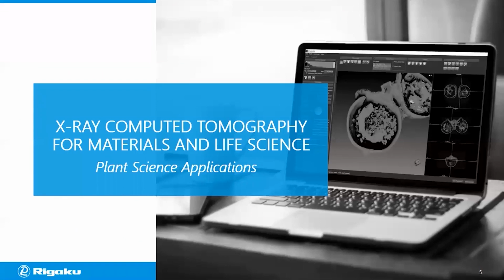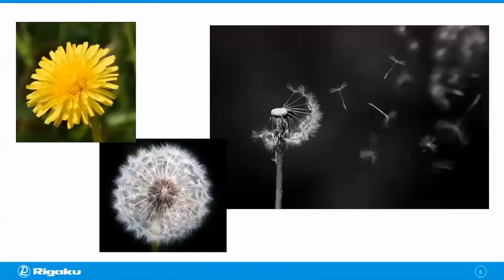So as you probably remember, if you've attended previous webinars, I referred to X-ray imaging as a form of photography, and it is. But if we decide that we want to X-ray image or photograph something, first we have to decide what we want an image of. So in this case, let's consider that our subject is a dandelion, and the dandelion has a diverse life cycle, so we have to decide what part or parts of the life cycle we want to image.